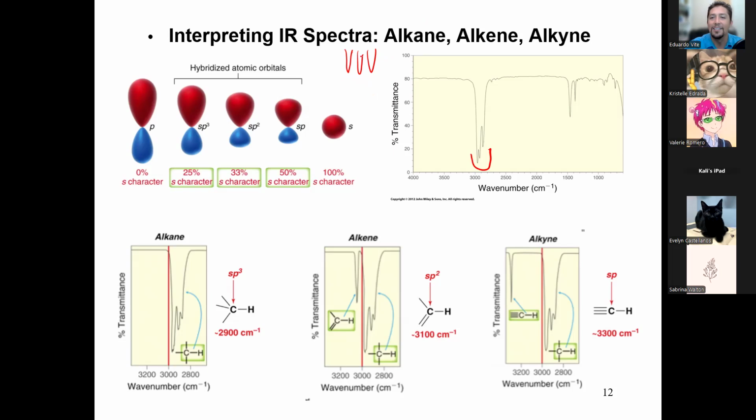Sorry about that. So you have your little peaks at the top of the cave. Those are called stalagmites. And that's what I like to call this group here. I like to call them the stalagmites. This is a carbon hydrogen sp3 stretch.